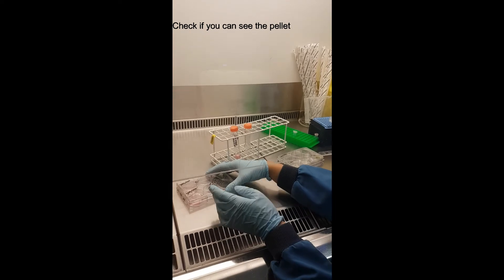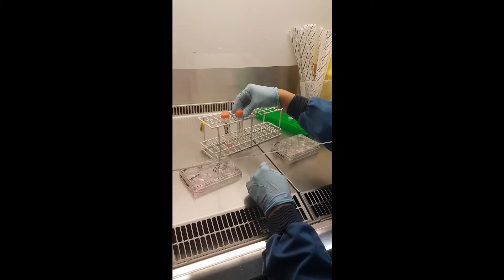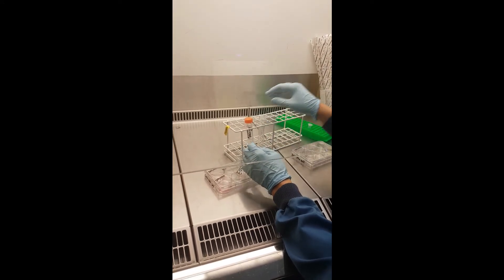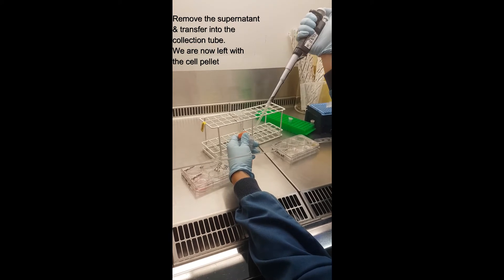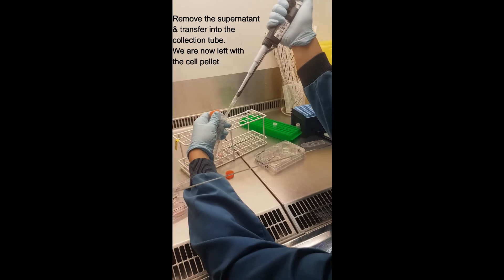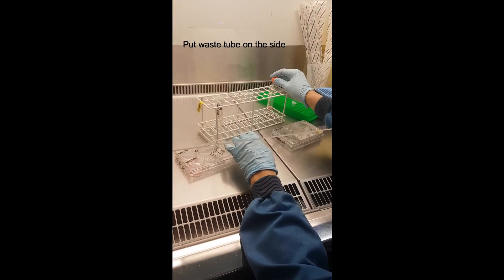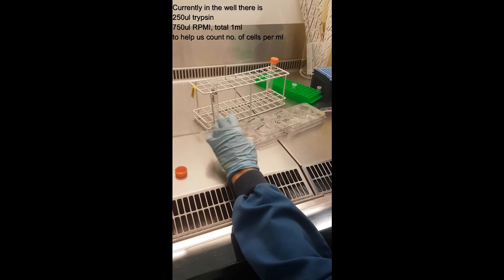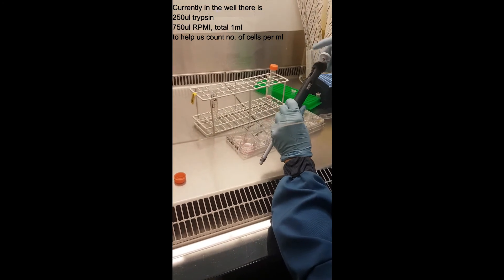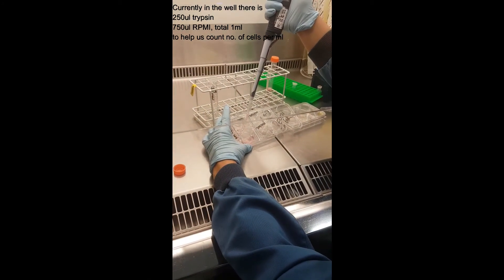Always check if you can clearly see the pellet. Also — though we didn't show it in the video — check if the cells actually detached: you can see by eye or check under the microscope. You don't have to remove all the medium from the pellet — leaving a little is okay. We have 250 µL trypsin plus 750 µL medium added, giving a total of 1 mL, which is convenient for counting because the counter reads cells per mL.